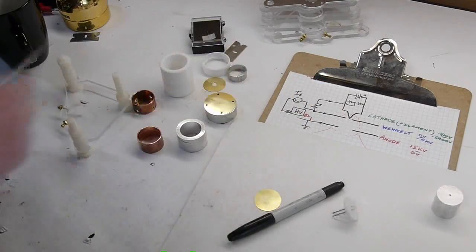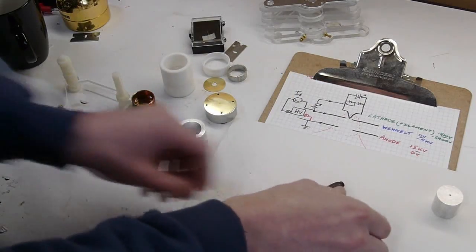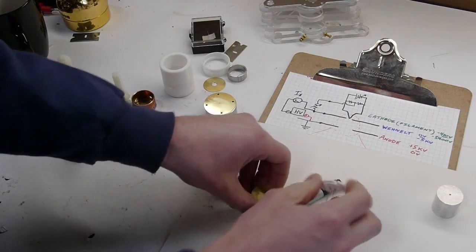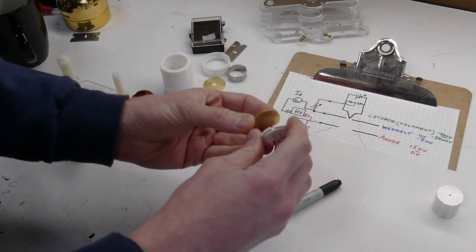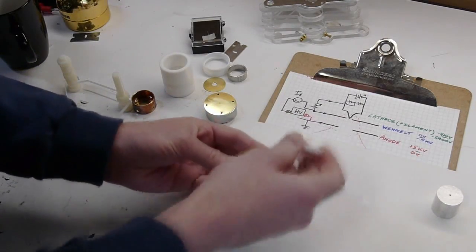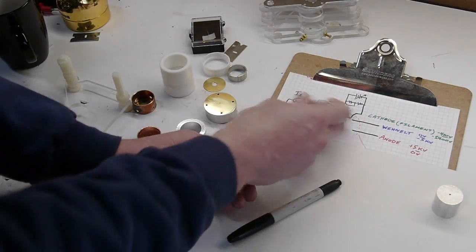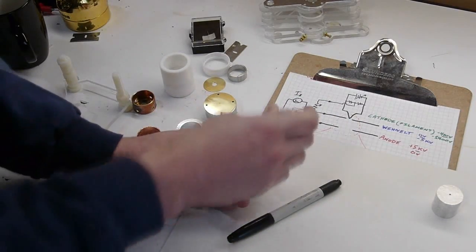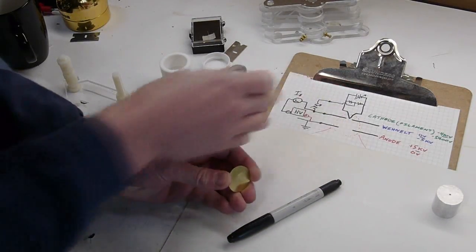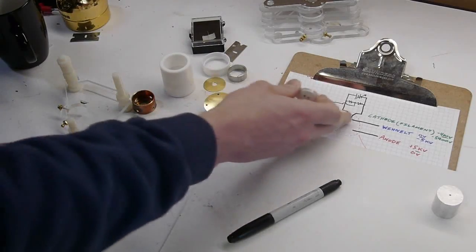In fact, it's so low that the filament actually protrudes into that hole a little bit. It's on the order of the hole diameter. So if the hole is 500 microns, ideally the filament would only be 500 microns above the bottom of this plate here, which is, I mean, these are small distances.